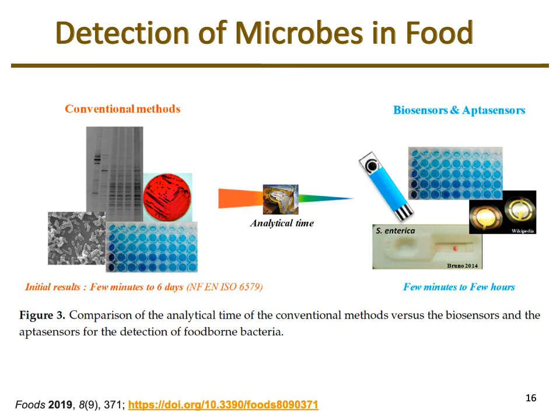So the conventional methods can vary from taking a few minutes to 6+ days, depending upon what method you're using. There's also the fact that your average worker at your food industry may not be able to do the technique, so there's a lot of additional training, which is great for us as biologists and scientists, but that kind of limits the accessibility of some of these techniques because you need to have devoted lab space for it.